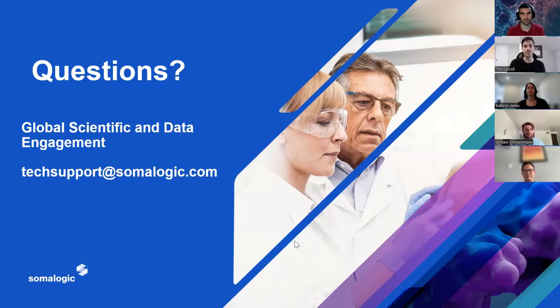Occasionally, we've seen some that have gone slightly below that. But we also want to set you guys up for success. We don't want you to have a study run with 12 subjects, and then the data comes back and it doesn't offer the same sort of impact for your studies, because then you would say, what's going on here? Maybe we should have had more samples, and we know how valuable your samples are. So we really want to maximize the work that you guys have. So that's typically why we ask for 40 as the minimum.